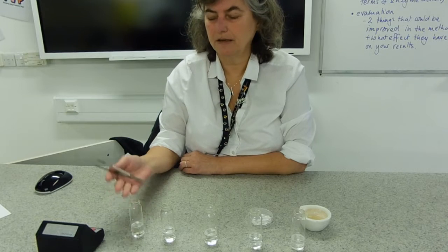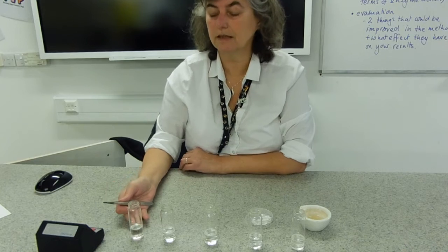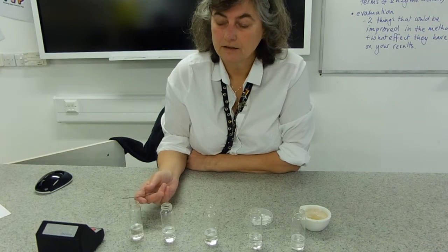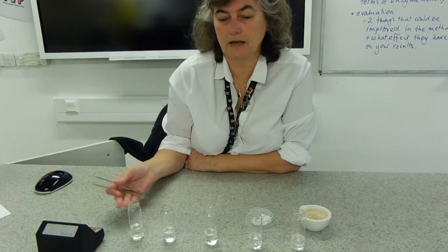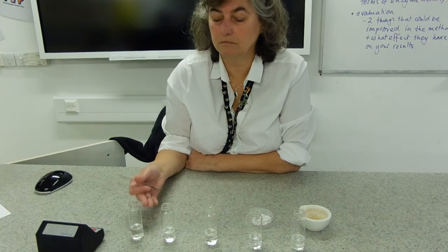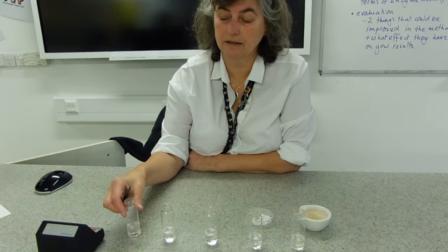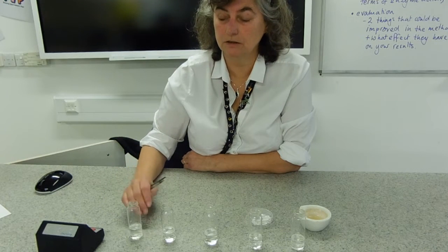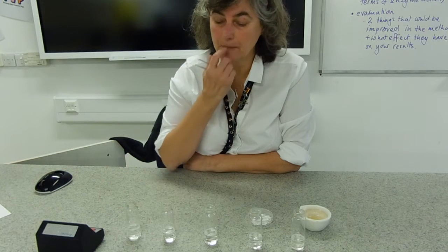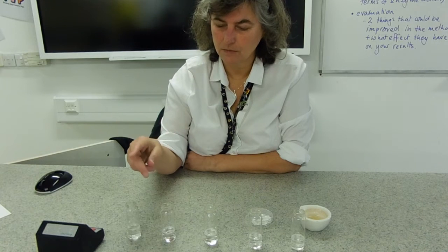I'm doing three repeats in each tube. One issue with that is a little bit of hydrogen peroxide gets used up each time, so one improvement you could make is to change the solution between your readings. Because the substrate concentration — what you're investigating — is going to change very slightly each time, you're better off with fresh solution each time, although life's too short to make up this many solutions, so that's why we do it this way.